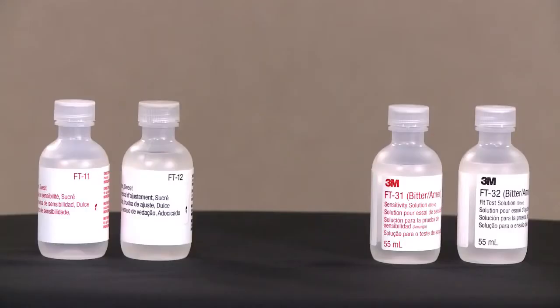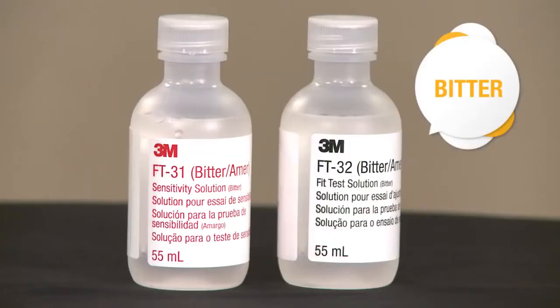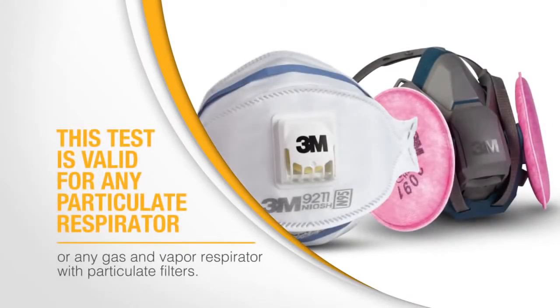One type of qualitative fit test can be performed with a mist that contains either saccharin, which is a sweetener, or a bitter-tasting substance known as Bitrex. The test process is the same for both test agents. Your instructor will tell you which material will be used for your fit test. This test is valid for any particulate respirator or any gas and vapor respirator with particulate filters. The particulate filters are used so that only face piece fit is tested.